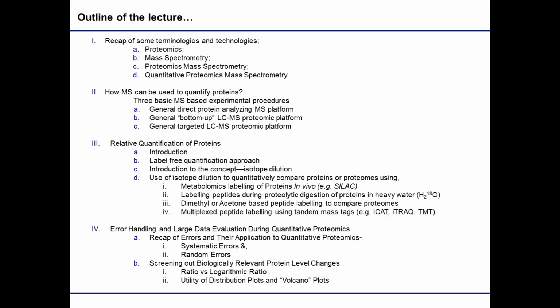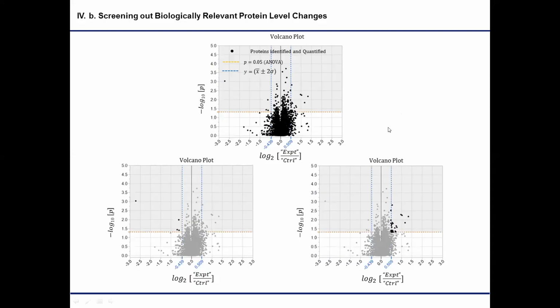So we have a question if you go back, Aruna. Yes. So what do the blue numbers that you have designated with the dashed lines coming from them signify? They signify basically the mean plus and minus 2 sigma.